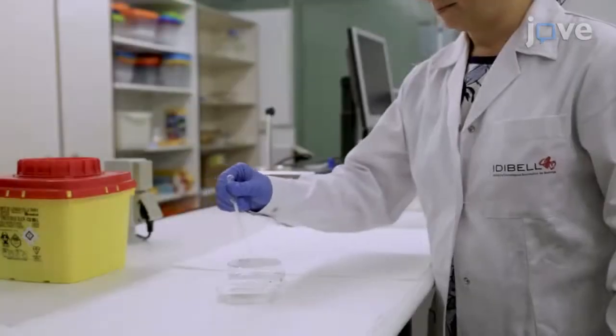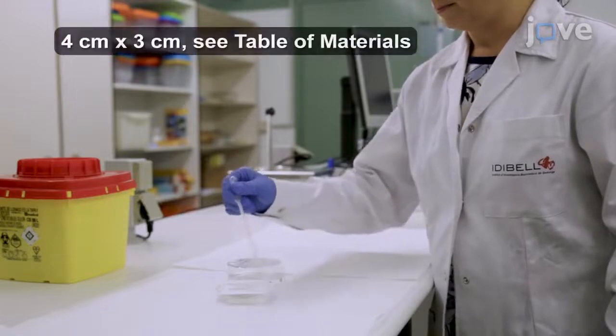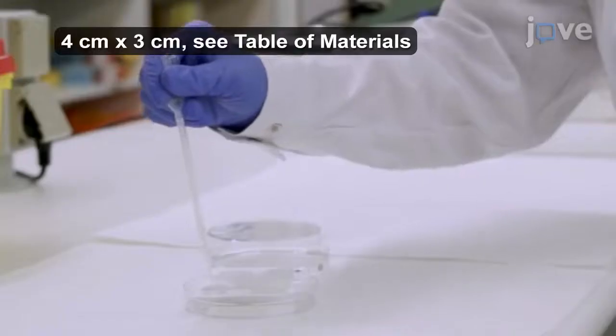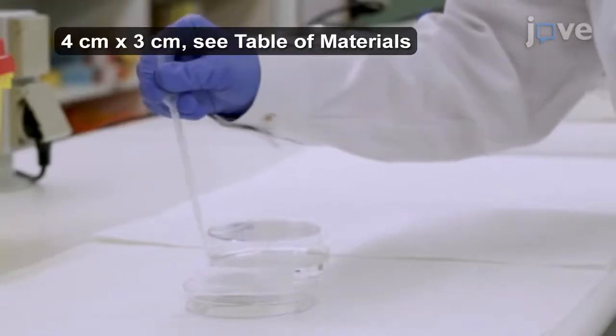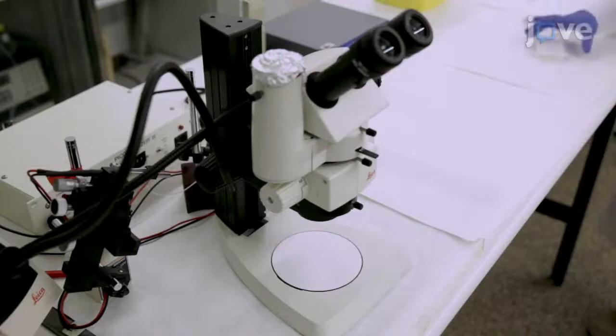Begin the transection procedure by wetting two pieces of cellulose qualitative filter paper in 0.02% MS222 anesthetic solution and placing them under the dissecting scope.